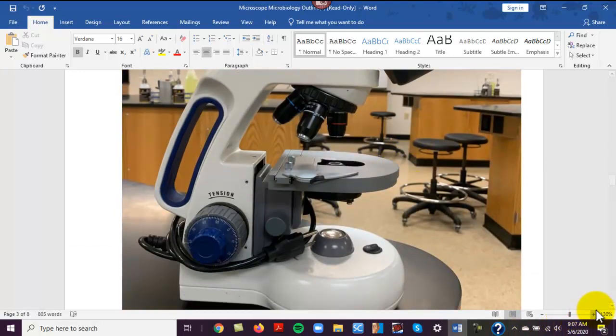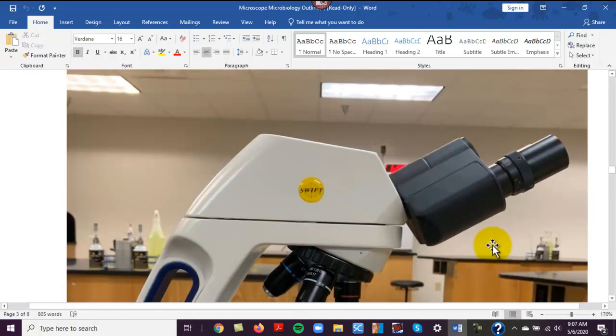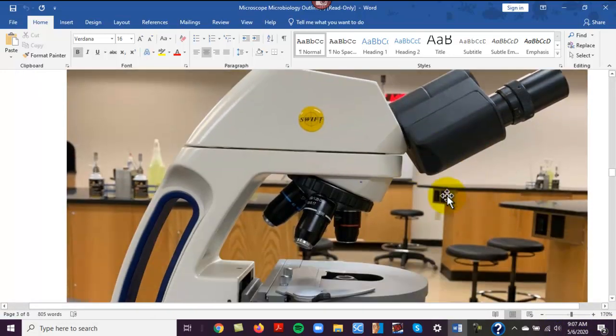So I'm going to use this one, and I did post these photos for you. I can blow this up. So here's a side view, and this is actually in our microbiology lab. You can see the tables. There's the disinfectant. Those are the little gas canisters we use. They're the inoculating loops that are sticking out with the racks.